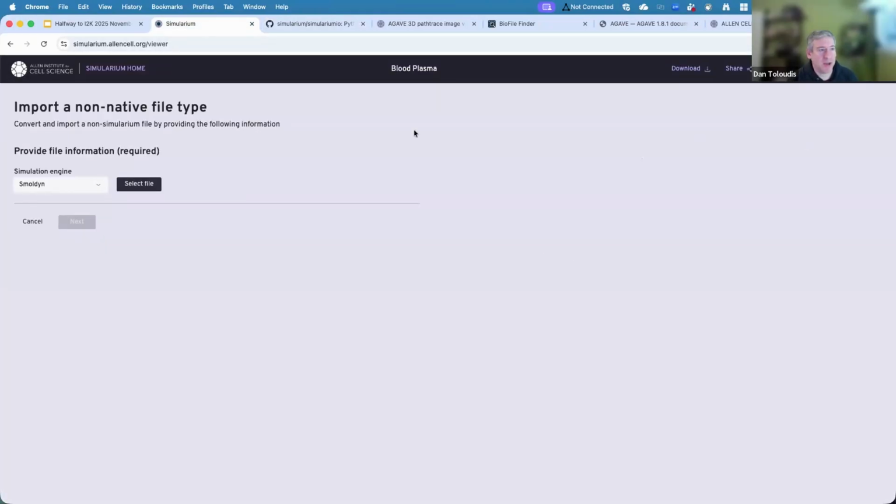So I don't actually know how much time I just took, but that's kind of everything I wanted to show about the viewer.